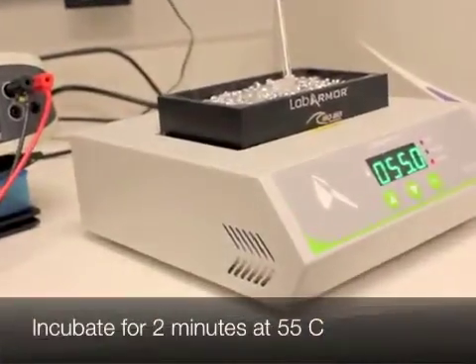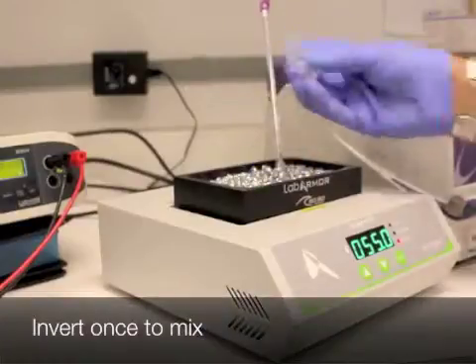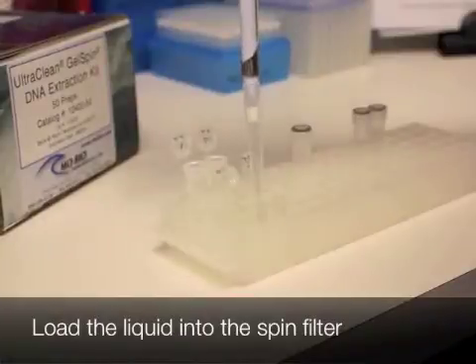Incubate for two minutes or until gel is melted at 55 degrees Celsius. Invert once to mix. Load the liquid into the spin filter.